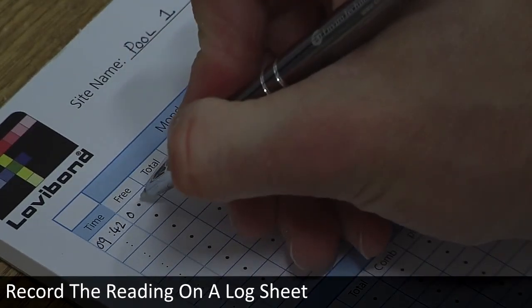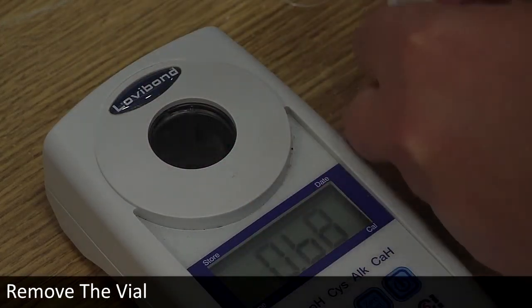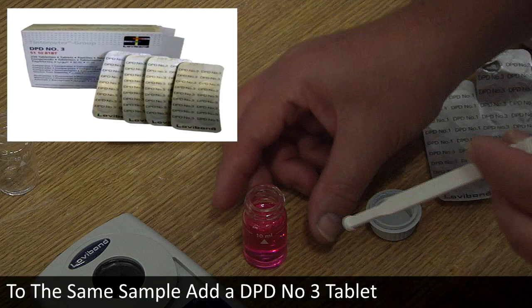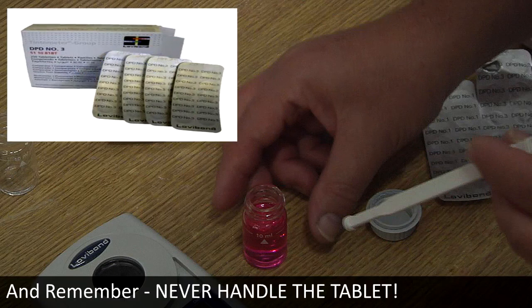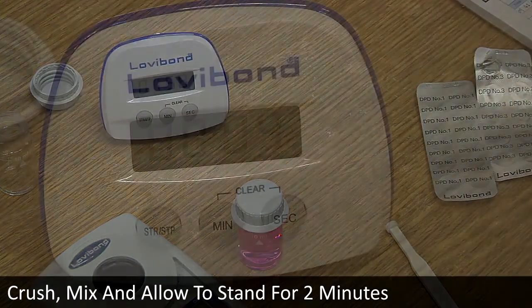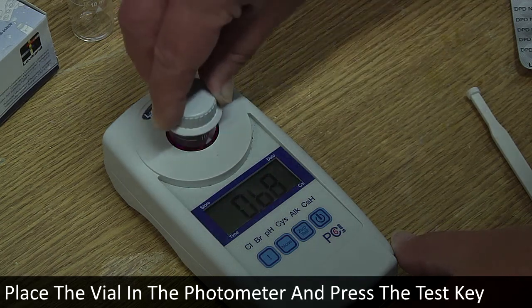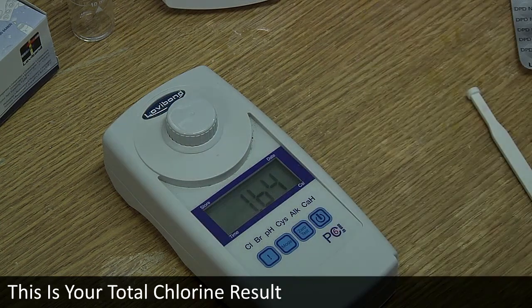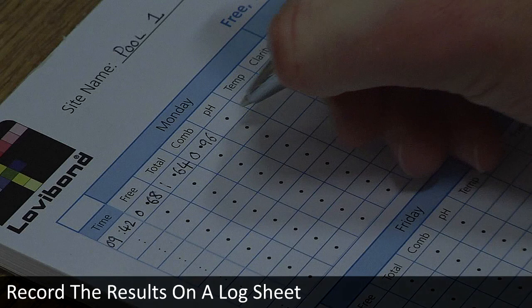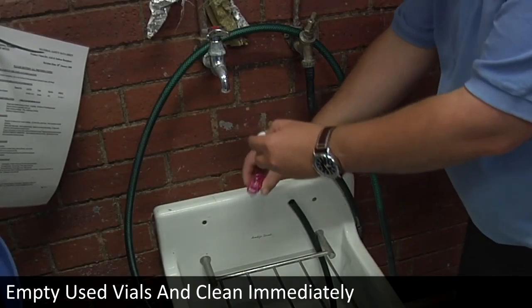Record the reading on a log sheet and remove the vial. To the same sample, add a DPD number three tablet — remember, never handle the tablet. Crush, mix, and allow to stand for two minutes. Replace the vial correctly in the photometer and press the test key. This is your total chlorine result. Record the results on a log sheet. Total chlorine minus free chlorine equals combined chlorine. Empty the used vials and clean immediately.